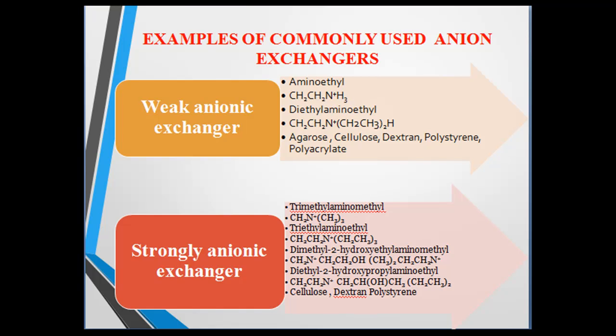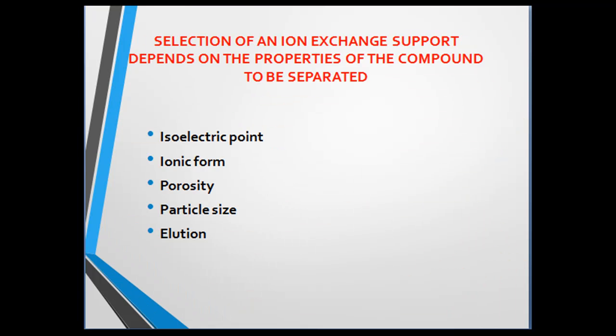Now we'll discuss different parameters which are important for selection of an ion exchange support, and they are isoelectric point, ionic forms, porosity, particle size.